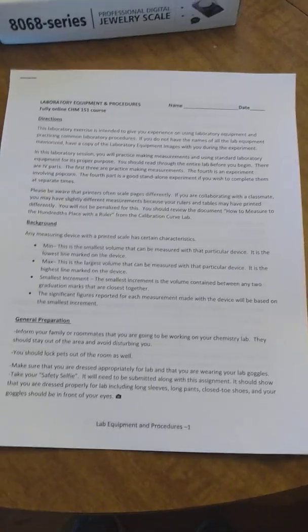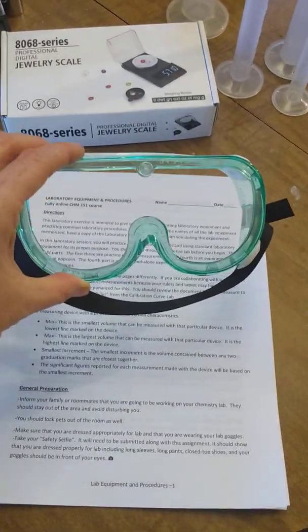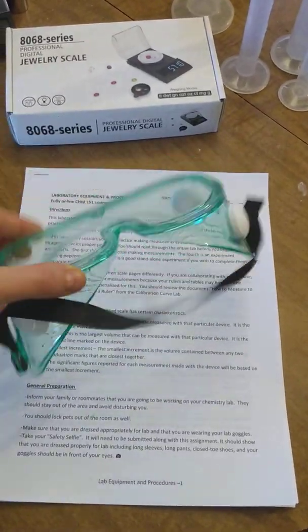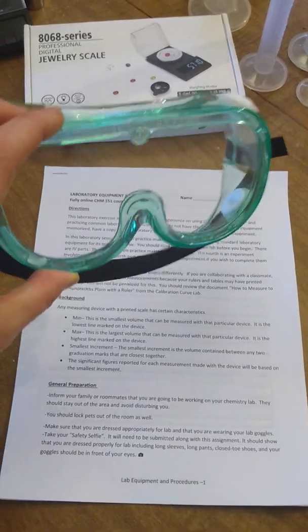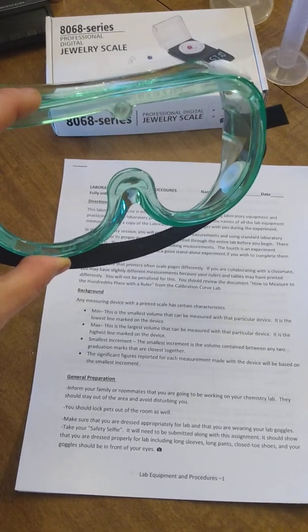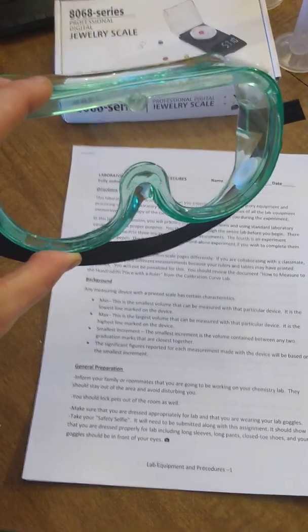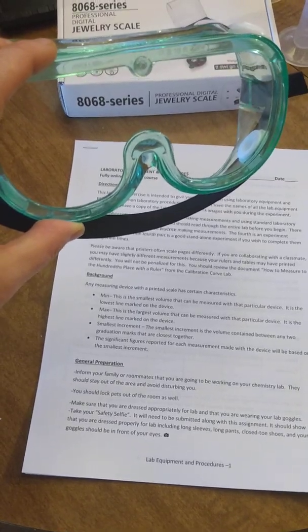First things first, we're always going to talk about safety. Your kit contains chemical safety goggles. Notice these are splash proof. You should wear these goggles in front of your eyes at all times when you are working on your chemistry lab. Even if you are only measuring water, you need to have these goggles on your face at all times.